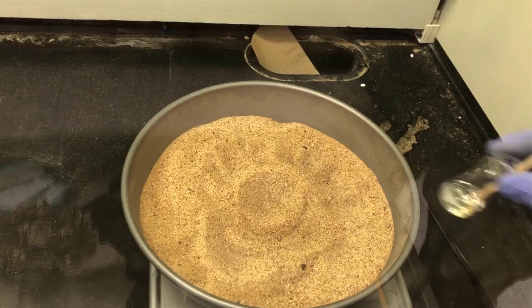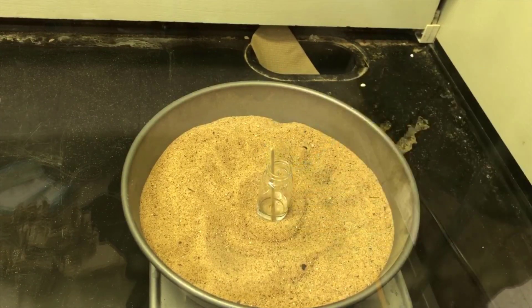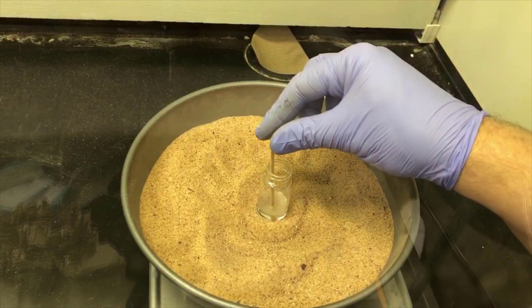Now I'm evaporating the ether in a sand bath. Notice how I have a stick inside this vial. The stick provides a surface for the bubbles to form on and help smooth out the boiling. You'll notice here in a minute, when I take the stick out, the boiling seems to stop.